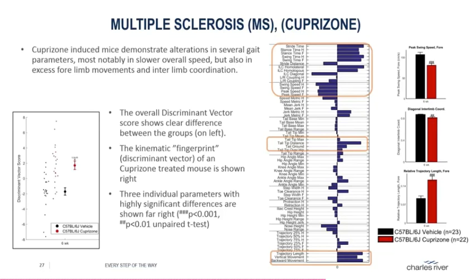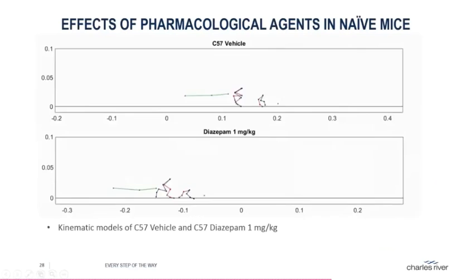On another note, in this study with the same mice, we performed also DTI imaging analysis. In a further analysis, we found that, interestingly, white matter-rich regions in corpus callosum correlate with multiple parameters in the kinematic analysis. Together, these build a bridge between the structural and functional changes in this model.